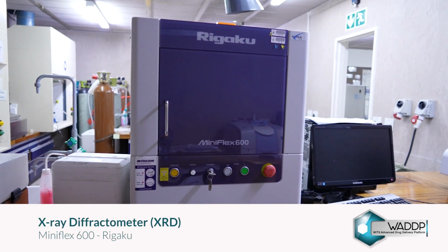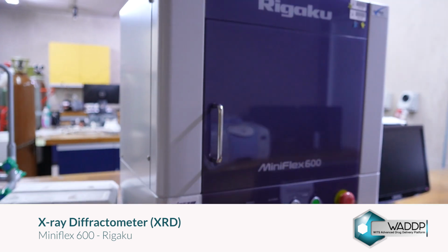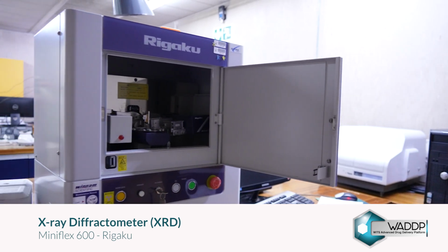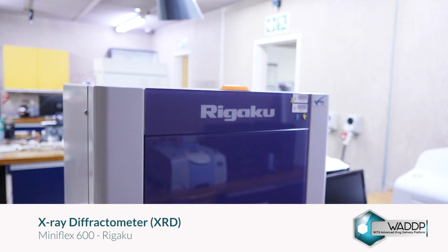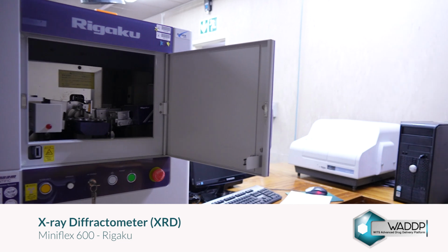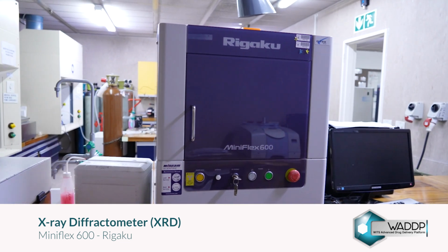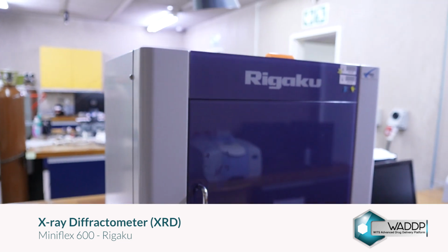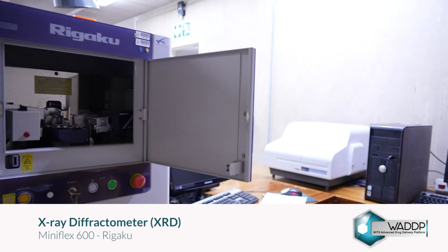The Rigaku MiniFlex 600 is a benchtop X-ray diffractometer, XRD, used for the analysis of crystalline materials, primarily powders. The system operates based on Bragg's law. It directs a monochromatic X-ray beam onto a sample, and a detector measures the resulting reflections.